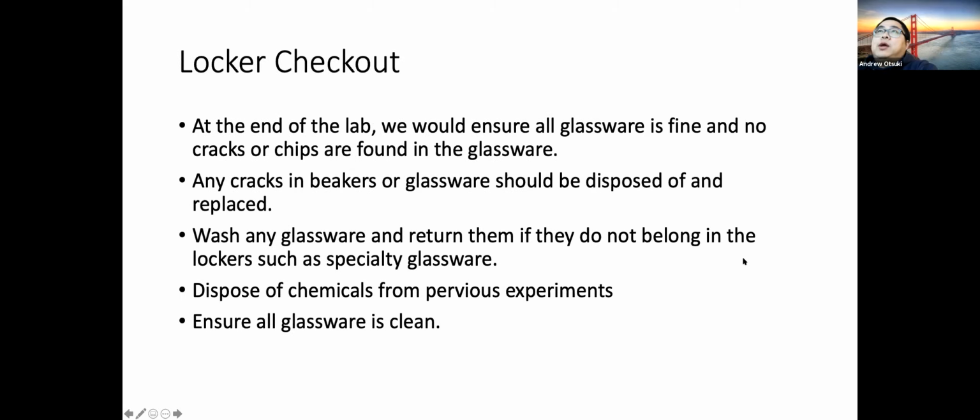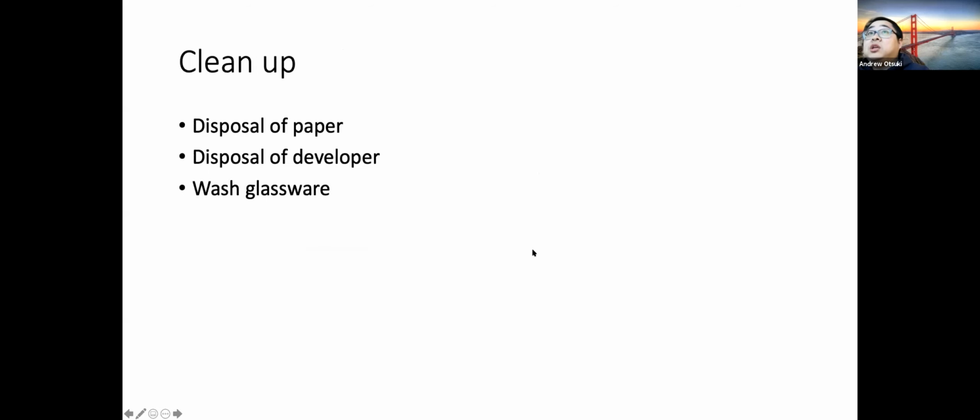All right, so stick around. I'm going to talk about cleanup. Then it's just procedure, so you get an experience of what you would have done if we were in lab. So cleanup: dispose of the paper, dispose of the developer solution, and wash your glassware.